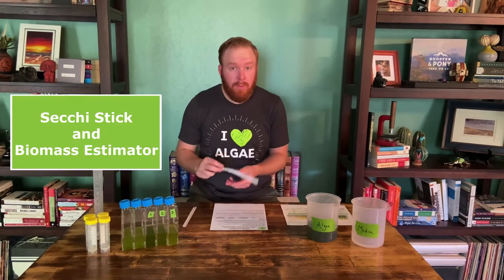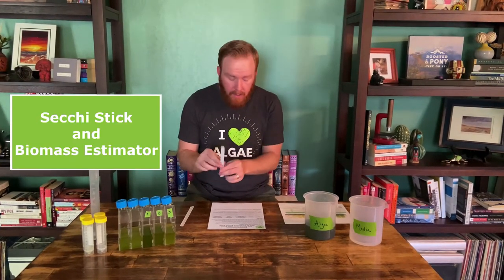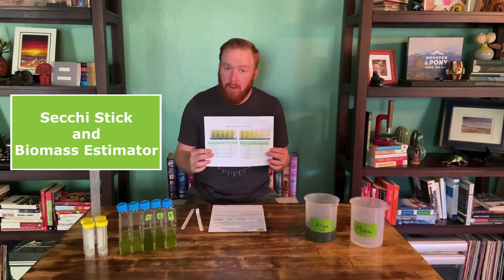To do that, we're going to use two different tools. We're going to use our SecchiStick, and we're also going to use the Algae Biomass Estimator.